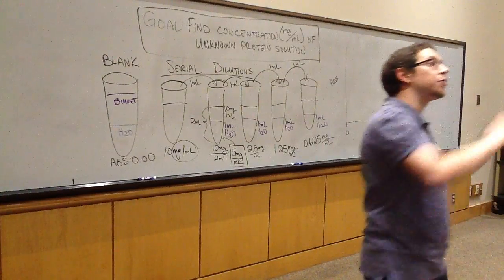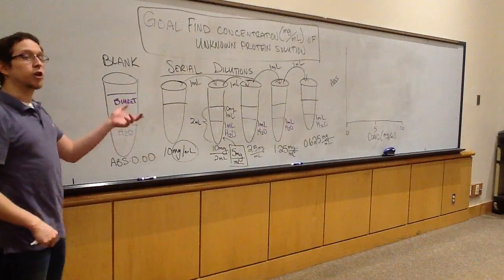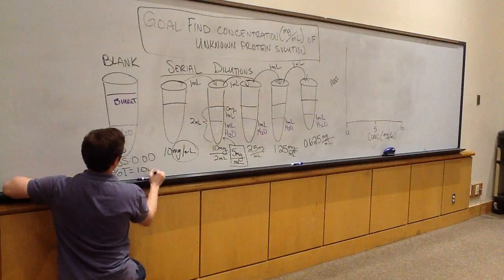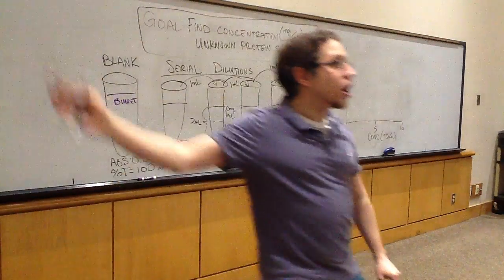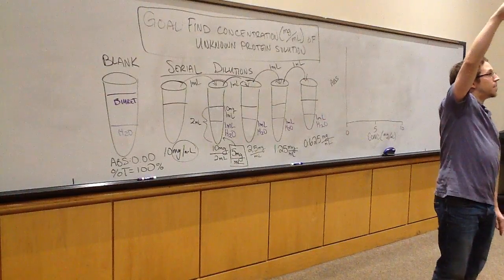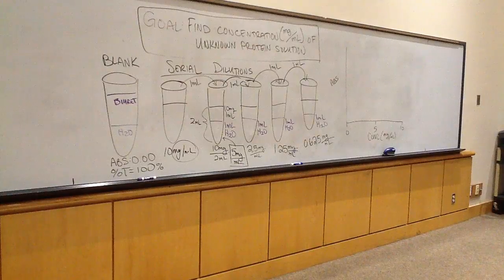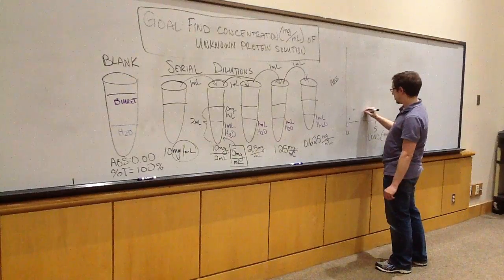Okay? Now those of you at the other campuses, you didn't press a 0 button. Instead what you did was you turned up the percent transmittance knob until the percent transmittance read 100. Now if you think about that, what that's telling you is that 100% of the light is passing through your sample. So if I've got 100% of the light passing through the sample, how much do I have being absorbed? 0. So no matter which way you did it, you did the exact same.